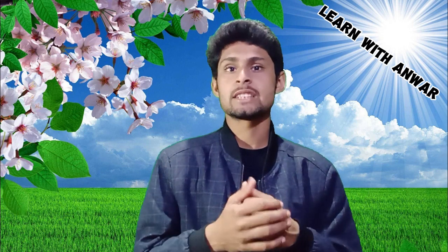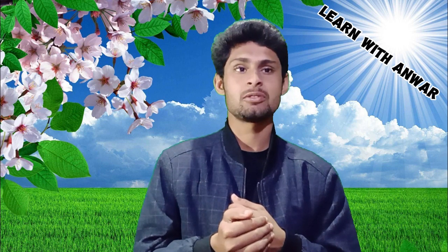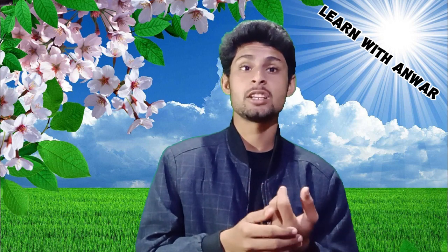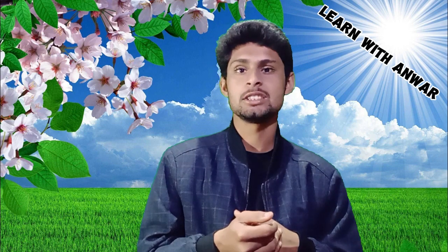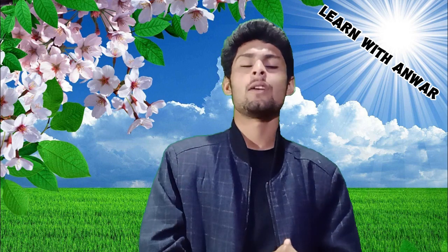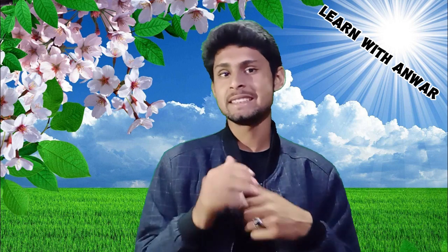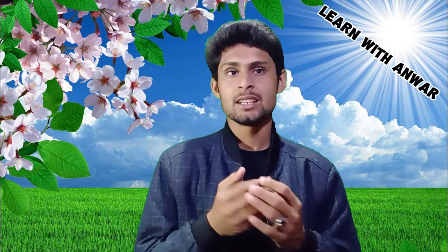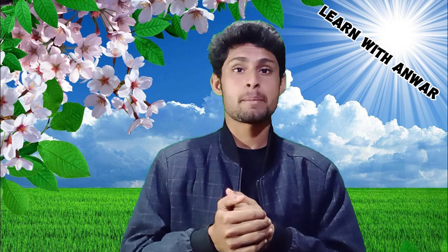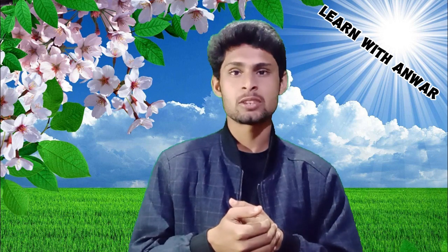Images of interest can be captured by photography through a microscope, a technique known as photomicrography. From the 19th century it was done with film, but digital imaging is now used extensively instead. Some digital microscopes have no eyepieces and provide the image directly on a computer screen. These have given rise to a new series of low-cost digital microscopes with a wide range of imaging possibilities, including time-lapse micrography, which has brought previously complex and costly tasks within reach of the young or amateur microscopist.